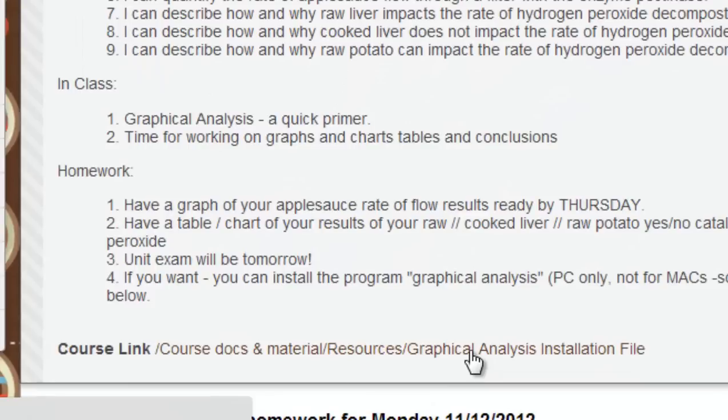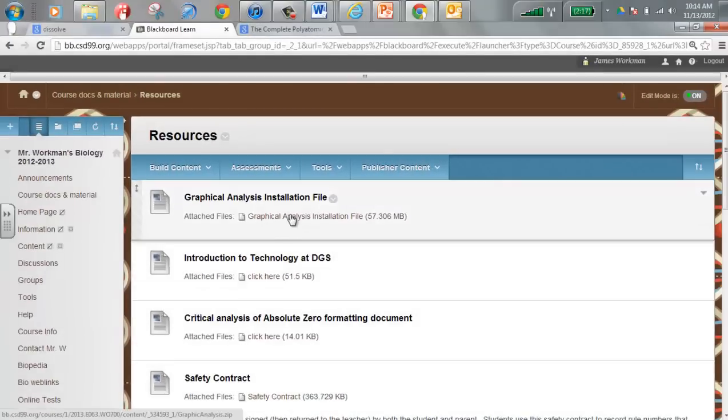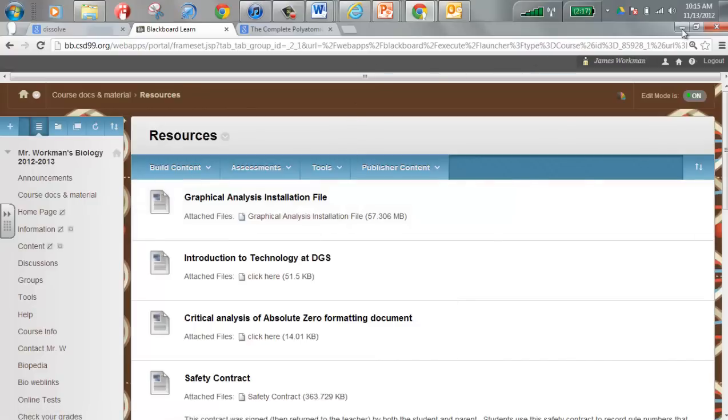If you click on this, this will take you to a list here and this is the installation file. It's 57 megabytes, not huge, but you double click on it, download it, and then you have to go through the run and install stuff. It only works for PCs, not Mac computers, sorry.